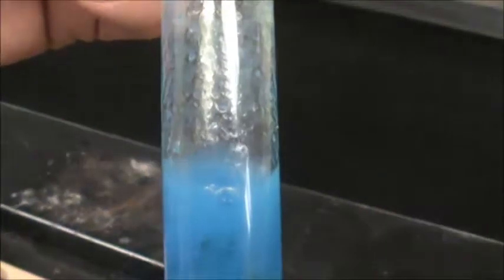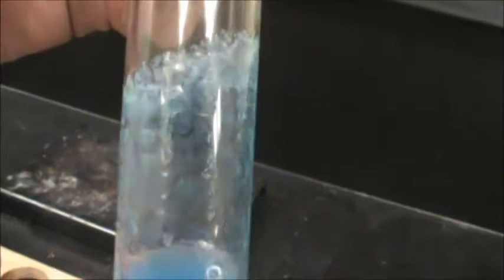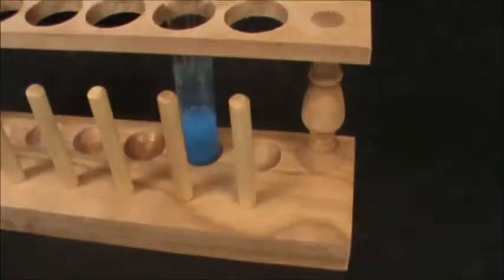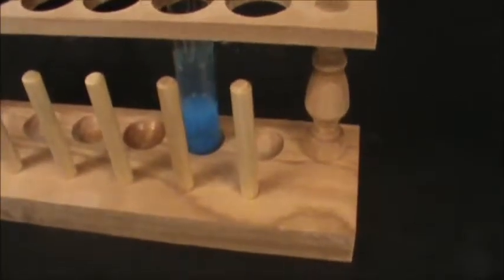Hopefully you're getting good stuff. Don't forget you can always rewind. You can see some of the crud that's left over. Like I said, it looks like almost like blue gel that's left over when they both react. So we definitely have a chemical reaction that took place here. Solid substance came out of solution. There it is. Again, did you want to compare? See the copper 2 chloride? And then our product afterwards.